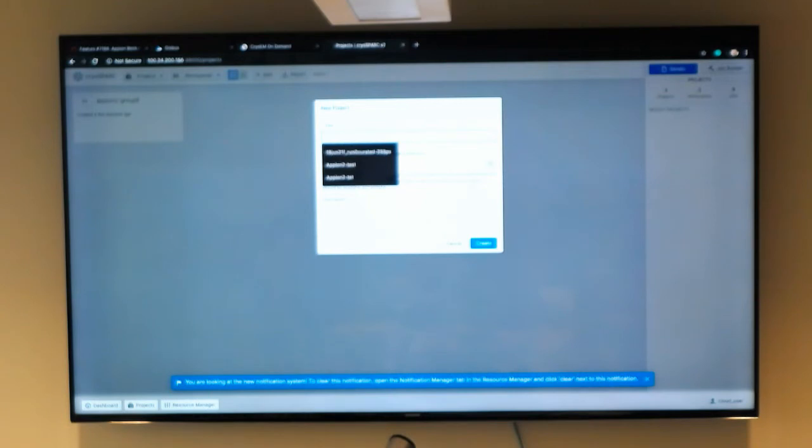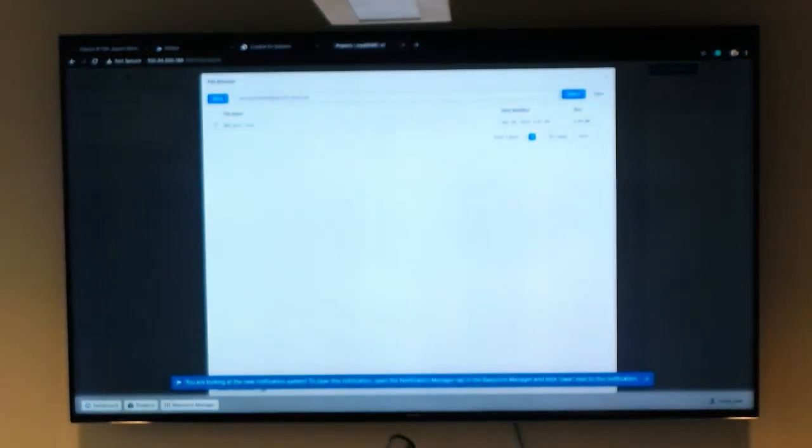But create your own project with your relative group. I misspelled, and I forgot it too. Okay, and where do you want to save that?